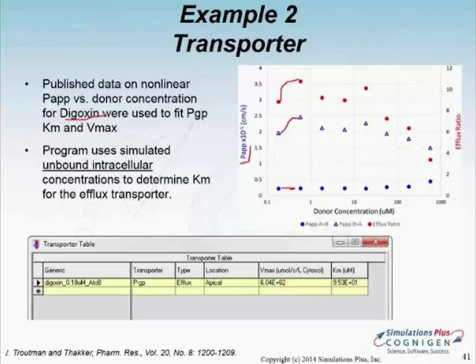Thank you, Viera. Another question. Does MembranePlus also take into account uptake transporters? Yes, of course. You can account for uptake or efflux transporters on either apical or basolateral membrane. Again, what we've provided was a tool where you can incorporate all of these processes, and when it comes to transporters, it's just a matter of what kind of system you are using and what compound you are working with, which transporters may be effective. You can incorporate any transporters in the system.